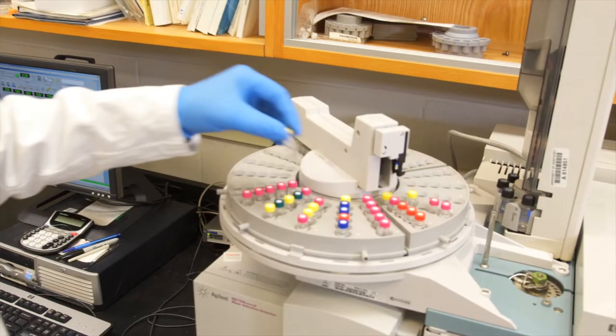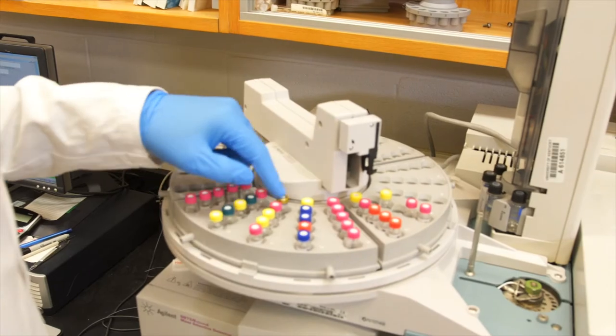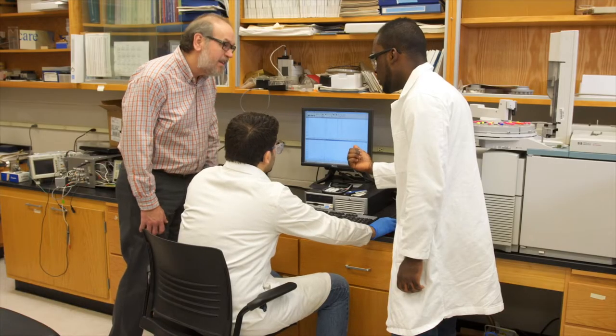That was the GC mass spec. You can inject a mixture of samples and it separates all of the analytes that you have in your sample. In the end, it reaches the mass spec detector so it can detect whatever sample comes out.